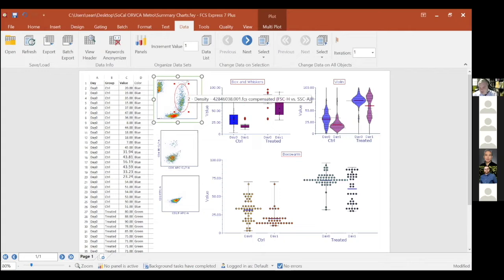Now, sometimes you have some detractors in here. They say, hey, this is just p-value hacking, right? No. You have to use this with your controls in hand. You don't just move these gates around until you get things to fit into the statistical significance that you want.